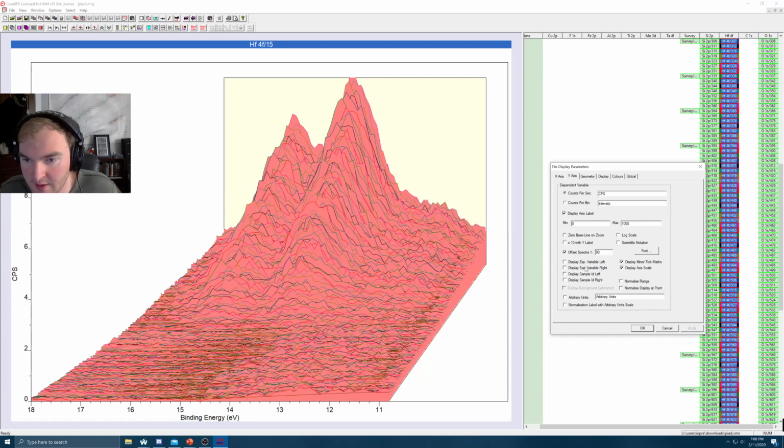The last thing I wanted to say is that if you don't have so many data points, sometimes in your image you can use this display, the experimental variable on the right, and if I hit apply you can see that this is the etch time. I haven't figured out a way to make this font in particular smaller so that it's legible, so I don't have any idea how to do that. But if you only have like 4 or 5 data points, it works well. So yeah, I'm gonna delete that now. So normally what I do is if I'm doing a 3D image, I just add the initial, final, and maybe label certain times that I think are important in a PowerPoint or whatever.